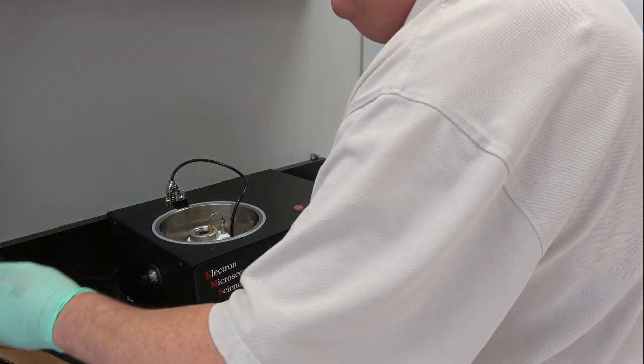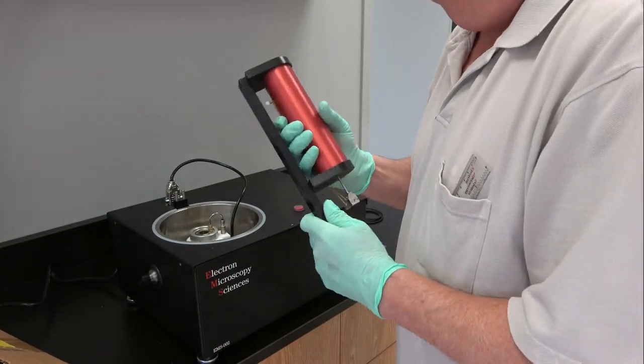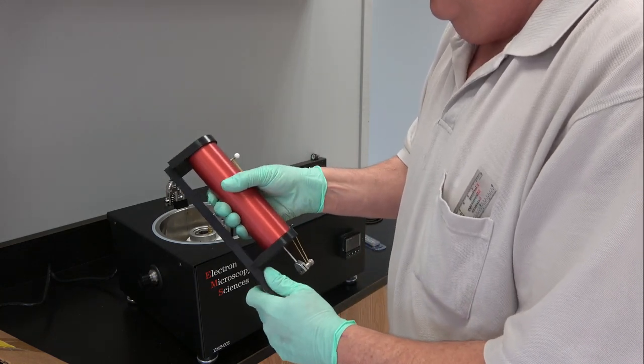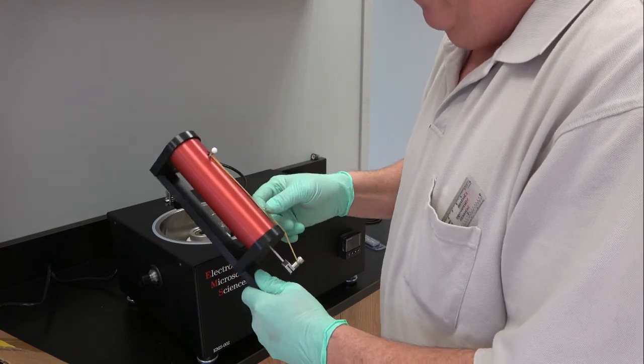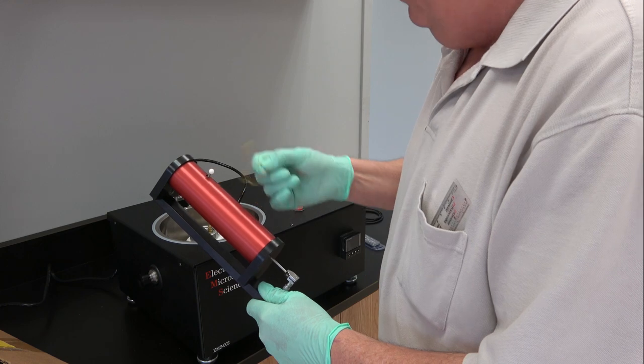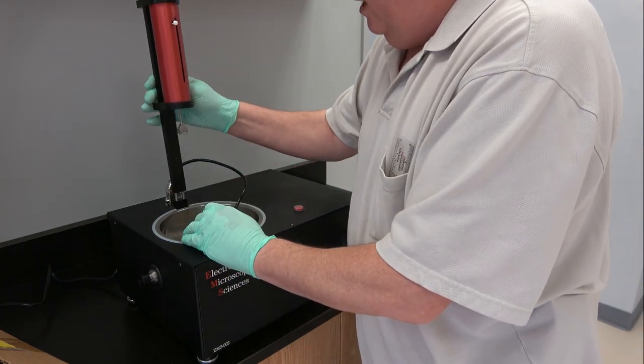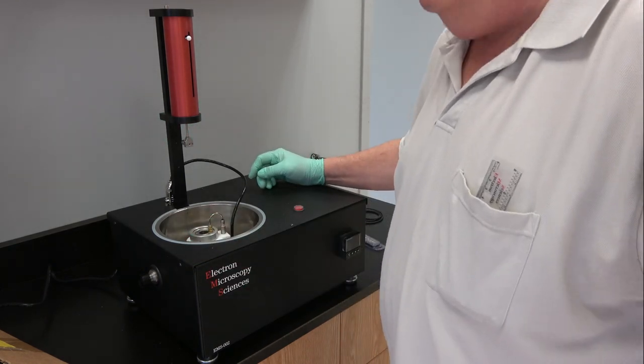What I'll do next is I'll mount the drop mechanism which I call the drop anvil. It is shipped with this part facing backwards just so nothing gets damaged, and that just simply slides down over those two pins.